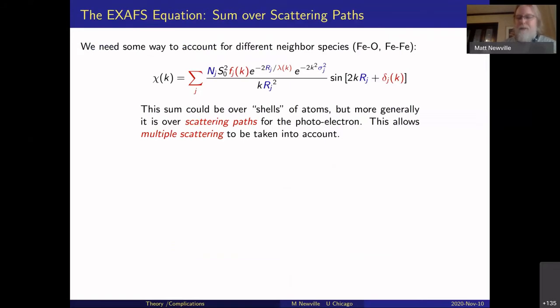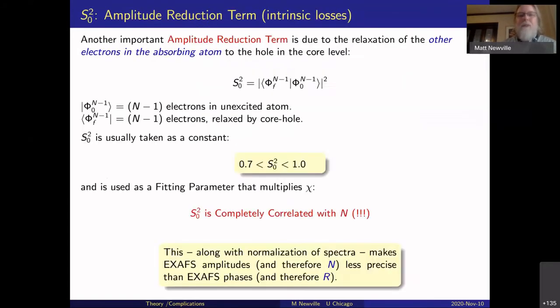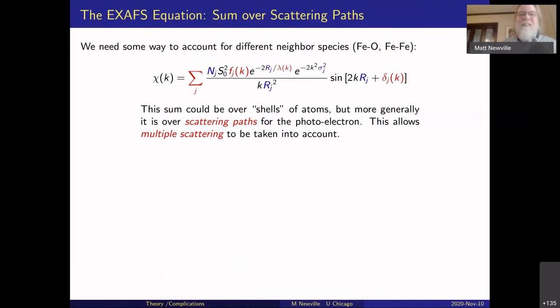So that means that at a beamline, we typically try to measure what that value should be for a selected absorbing atom. It should be that it doesn't depend on anything except the absorbing atom. All iron should be the same, but it might be that all iron at a particular beamline is the same. Might be a better way to phrase that. Because it takes into account some, although it's theoretical, it also helps take into account some artifacts of the measurement.